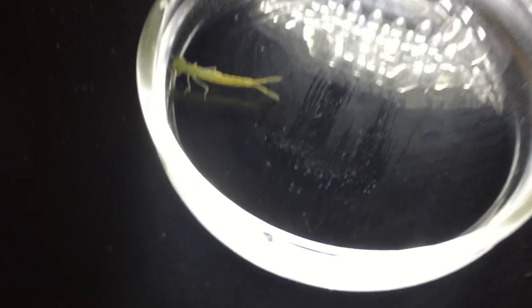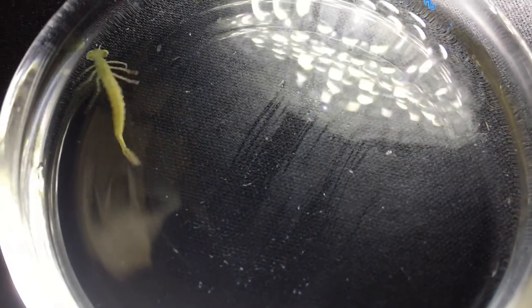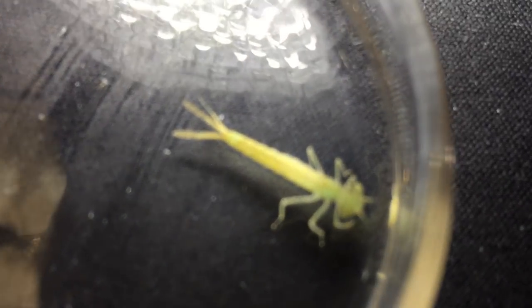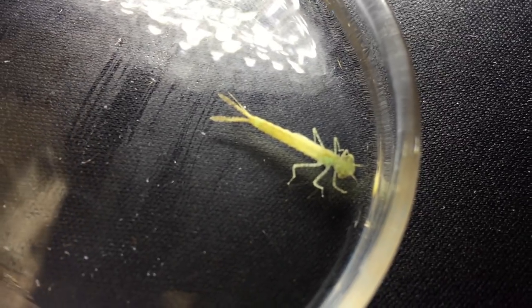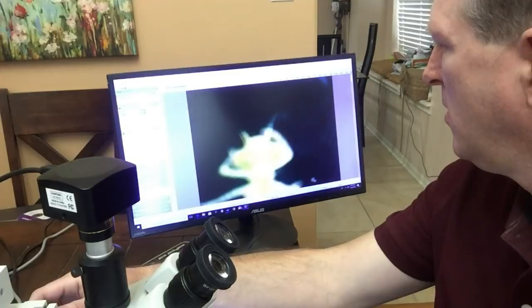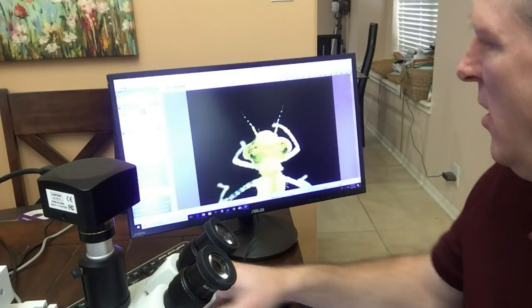So let's get close and personal with a mayfly nymph. Okay, so here's our subject for today. Here we have the mayfly nymph, really small guy, probably about two centimeters long. And this is what we're going to be putting under the microscope today.